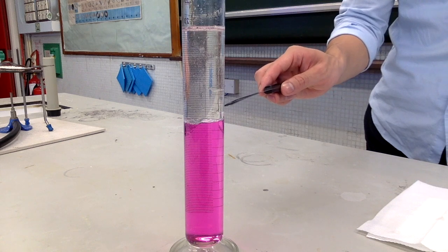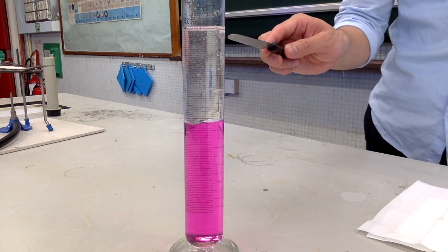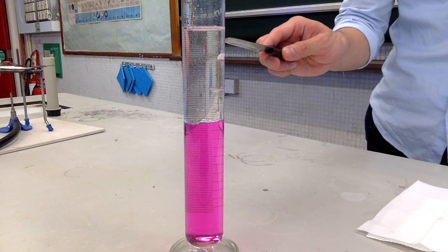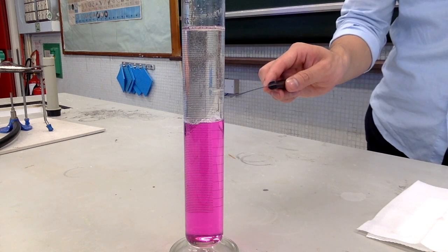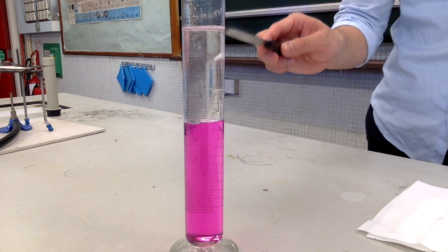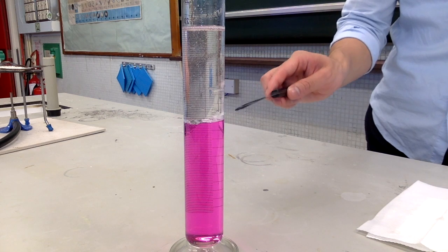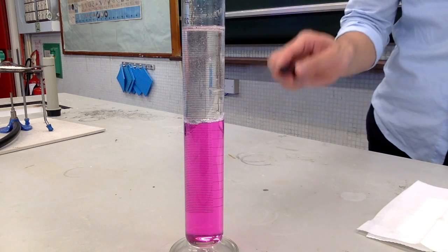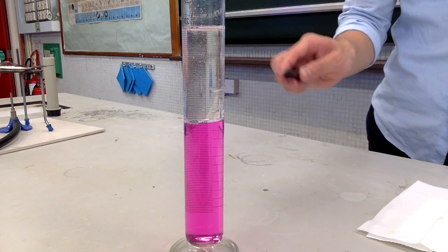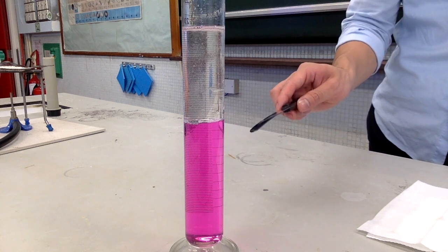But once the sodium travels to the top and the hydrogen bubbles are all dissipated, are all gone, then the sodium metal, being denser than the paraffin oil, will again sink to the bottom, where it again touches the water, and this cycle repeats.